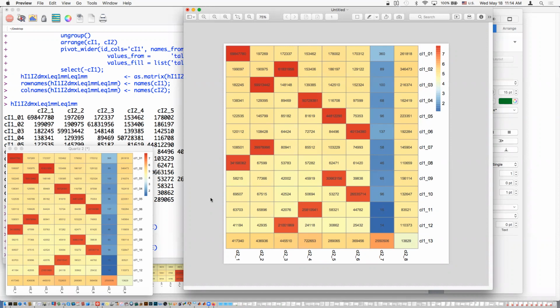Here, everything that lands in a wrong pile is not so harmful to us. Yeah, it looks like it reduces coverage, but it's better to reduce the coverage because it pulls them out from the file you were going to put them in, right? The alternative to losing a little bit of coverage was to put them in this file and have them be misassigned. They were dead for coverage whether you knew it or not, right? The far worse problem is that misassignment. So without the ability to have them land in empty squares, you would be misassigning samples. So that is why you want your duals.